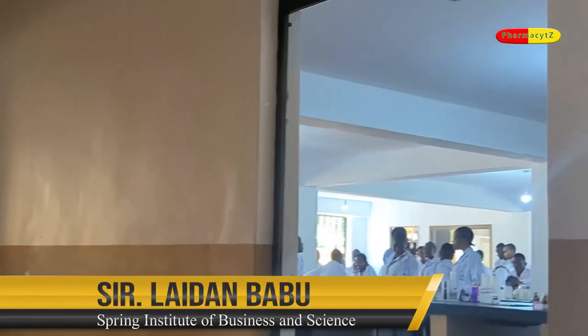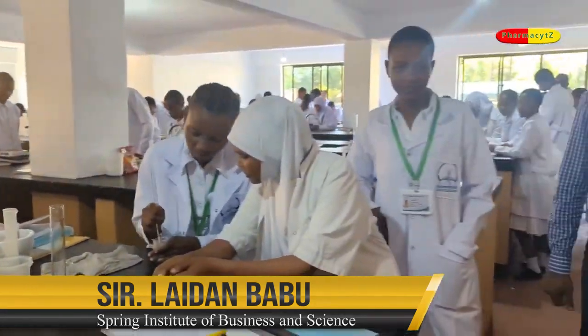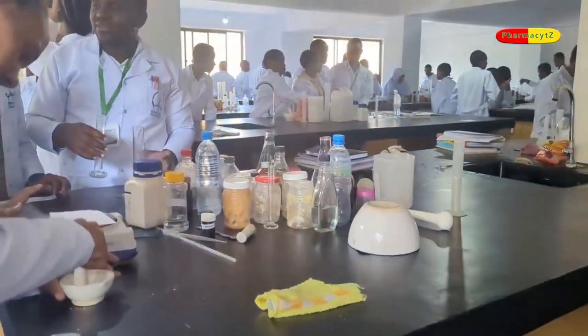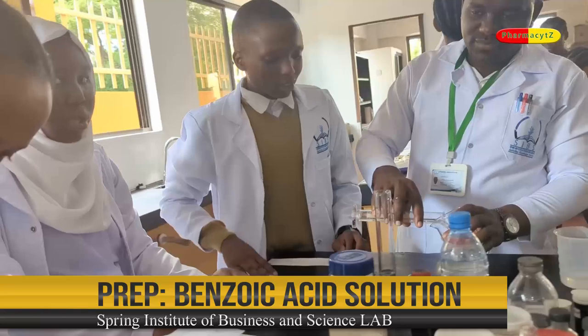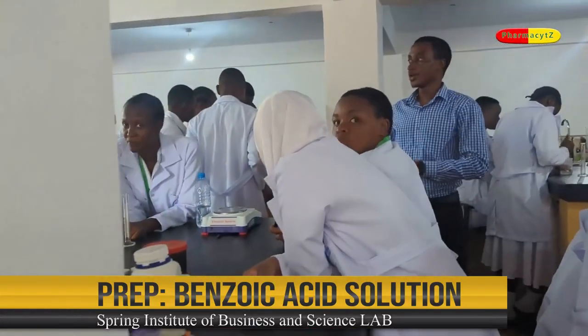Once again, we are going to have one of the complicated solutions to make today, and this is benzoic acid solution. This is a compounding laboratory at Spring Institute of Business and Science, and your instructor is Sir Laidan Babu.